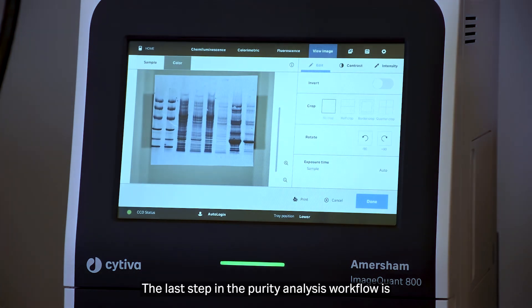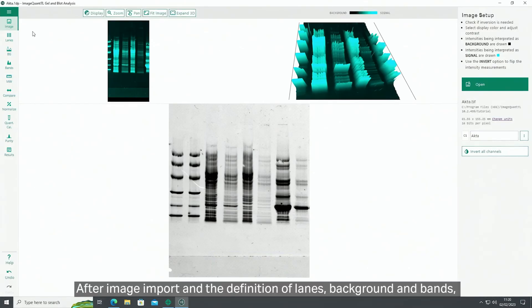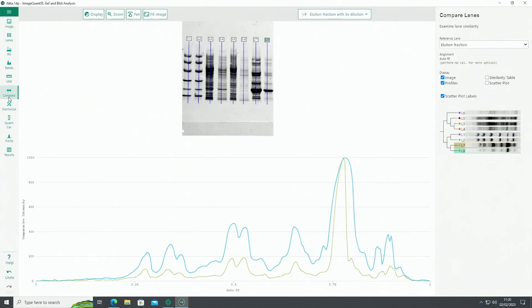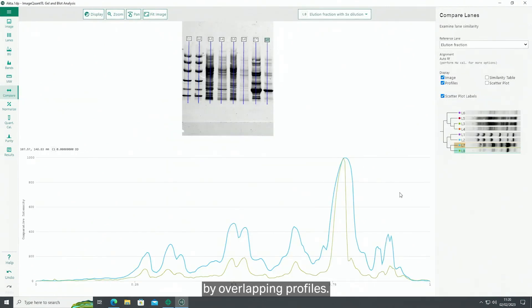The last step in the purity analysis workflow is quantitation in a dedicated software program. After image import and the definition of lanes, background, and bands, you can for instance compare lanes from different runs by overlapping profiles.